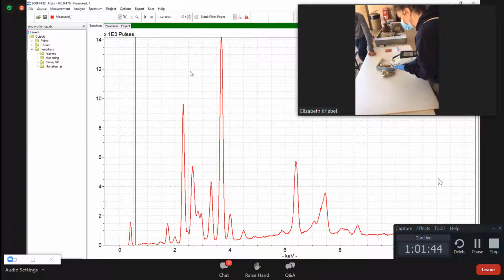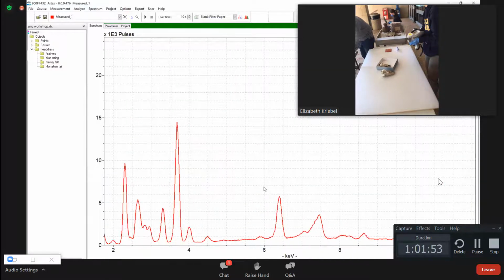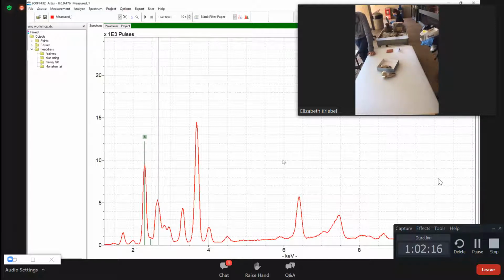Excellent, you're good. So what we have here, it's not going to be too surprising. I've got good news. There's no dramatic, scary elements in this. Oh, good. So safe for children. We've got a lot of sulfur, so leather. Anytime you see a big sulfur peak like that, it's leather or an animal product. By the way, you remember that lithic stone we had earlier? If you were to measure a rock and see a big pocket of sulfur on it, that can sometimes say, hey, there's a residue here. You can test and see what they were using this on. That can be really nice as a screener.